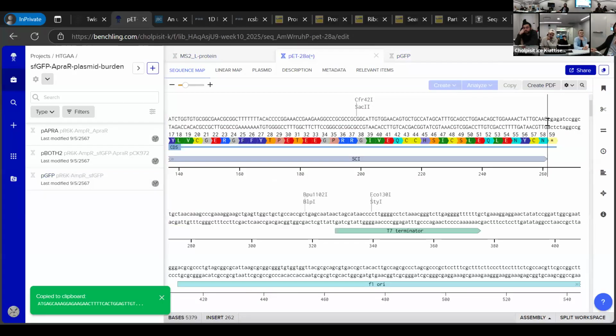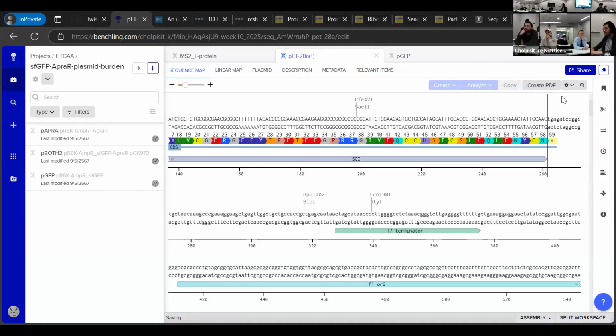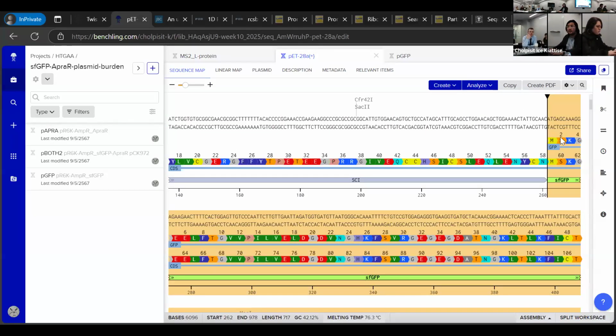One of the keywords that is important for designing the gene cassette is that they are in frame. What does it mean? When the ribosome reads your sequence, it should read in 3 base codons. So if it's out of frame, it's not going to be the same piece of protein. So now that I'm pasting this sfGFP on top of this single chain insulin, it's going to be a fusion protein only if it is in frame, right?